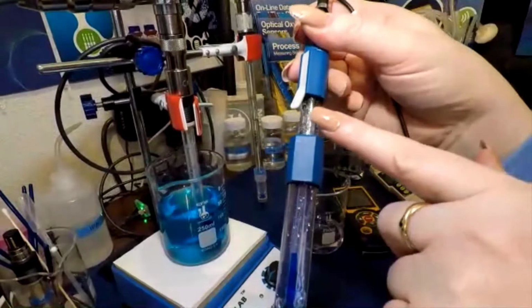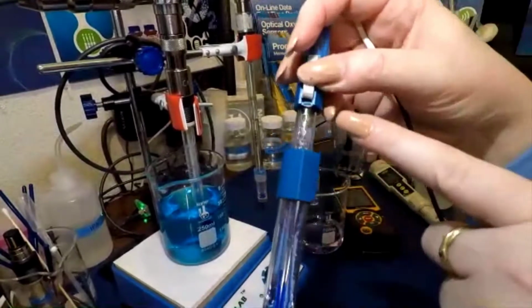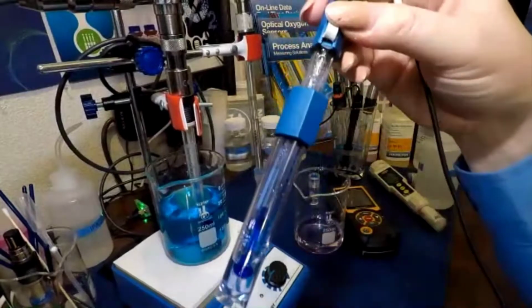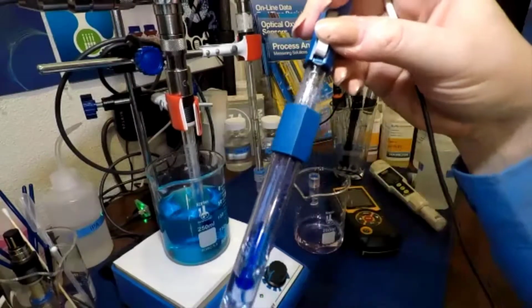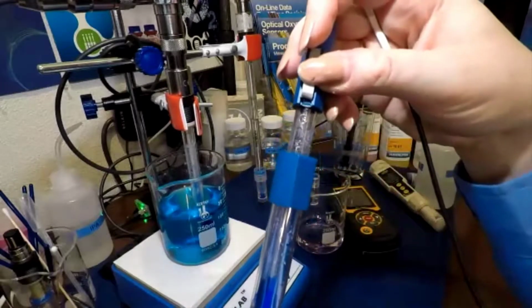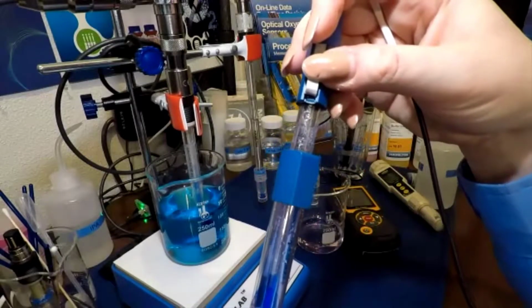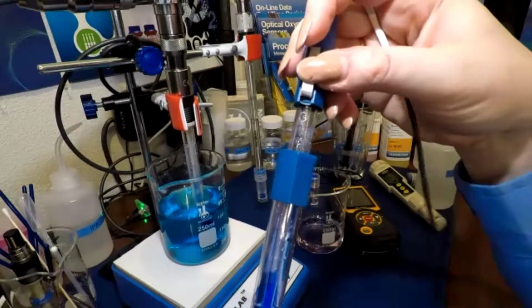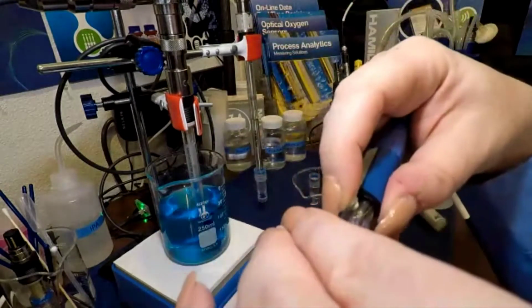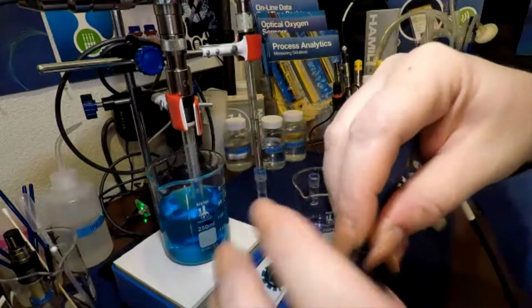Once a week, you need to dump out the electrolyte that's inside of your probe. Do a quick rinse with some DI water in there. Do a quick rinse with some electrolyte, and then refill your probe to the correct fill line with electrolyte. If you're doing a lot of measurements, you may need to check this midweek to verify. For storage, put your cap on to plug it away.